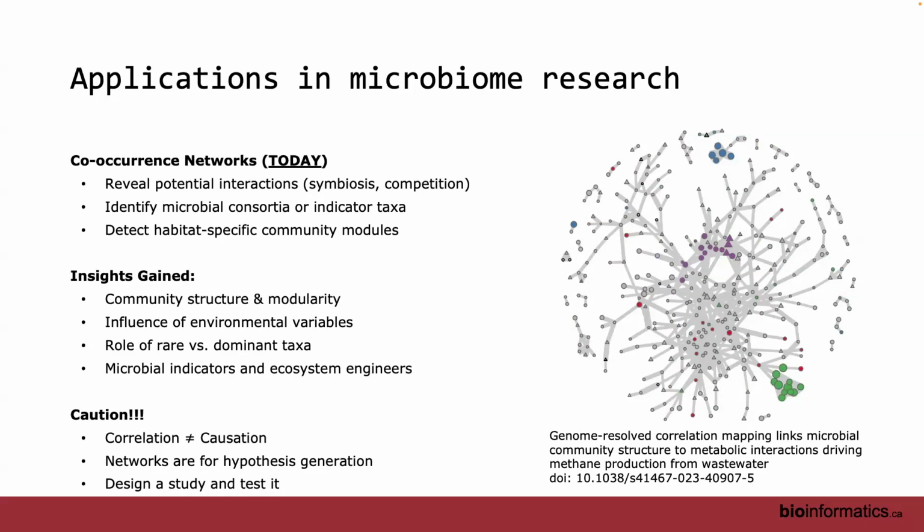All right, so applications in microbiome data, we're trying to show these interactions. As I said, we're looking for competition and symbiosis. We're trying to identify microbial consortia and indicator species for whatever particular treatment that we have.